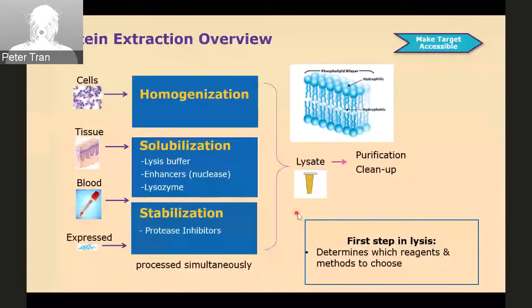Then we get the cell lysate, and we use the cell lysate for purification or cleanup. The first step in lysis is that you need to determine which reagents and method to choose.